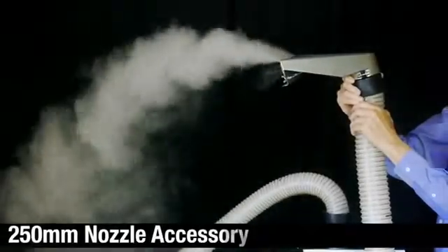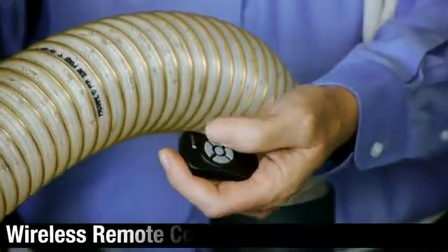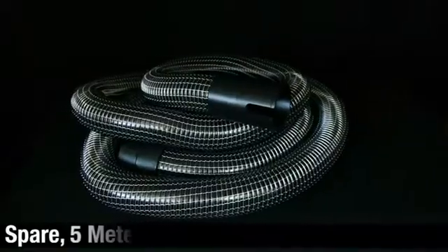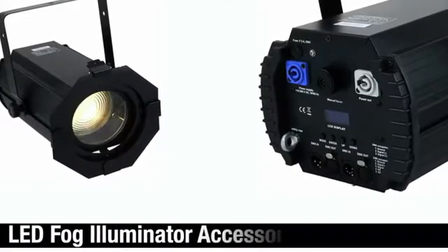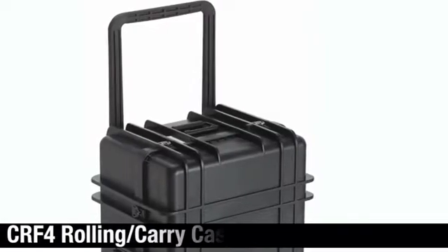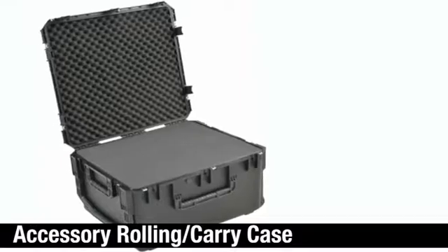A 250 millimeter fog nozzle concentrates fog into a small area around equipment. A 1.3 meter fog wand creates a wide visual fog curtain. Wireless remote control provides remote CR4 control at a distance or behind a wall. Spare 5-meter hose — use two hoses with a Y adapter or T adapter for dual fog output. LED fog illuminator provides superb contrast between fog foreground and background. CR4 rolling carry case and accessory rolling carry case provide protection during transport and storage.